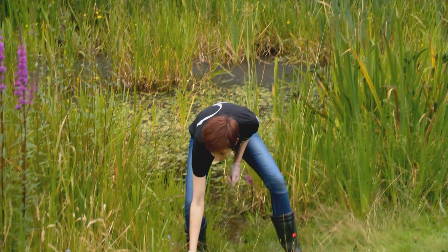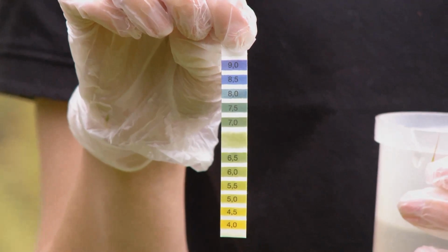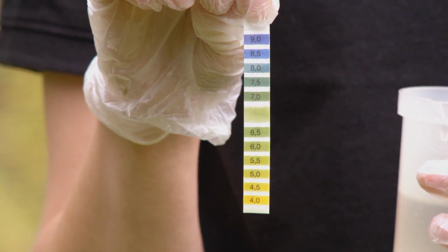To do so, you'll need a pH strip like this. The centre of the pH strip is our indicator strip. This doesn't have a number on it. This will change colour based on the acidity of the water. You'll need to take samples of water from the pond. Take around about 10 samples to make sure you're getting a fair representation of the pH of the overall pond. Also remember to rinse out your sampling equipment in between use so that you're not contaminating each sample.